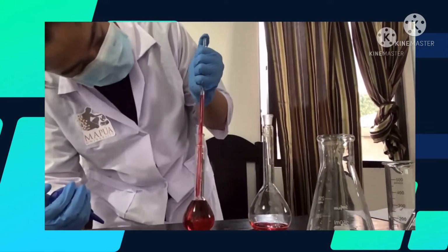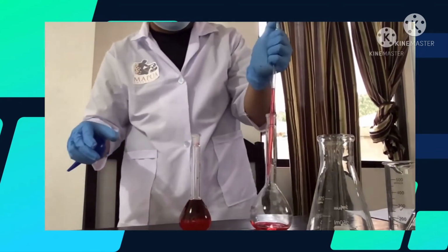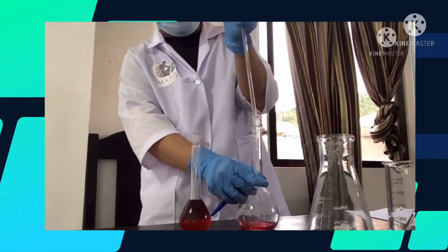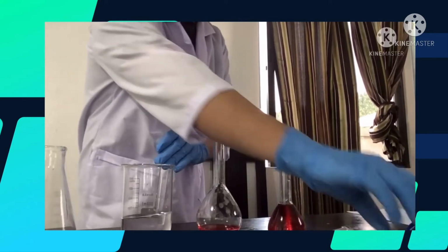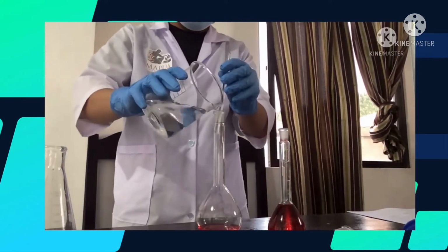Again, since we are using a 5 ml pipette, we are going to pipette 5 ml twice. Dilute the solution in the volumetric flask to the mark.